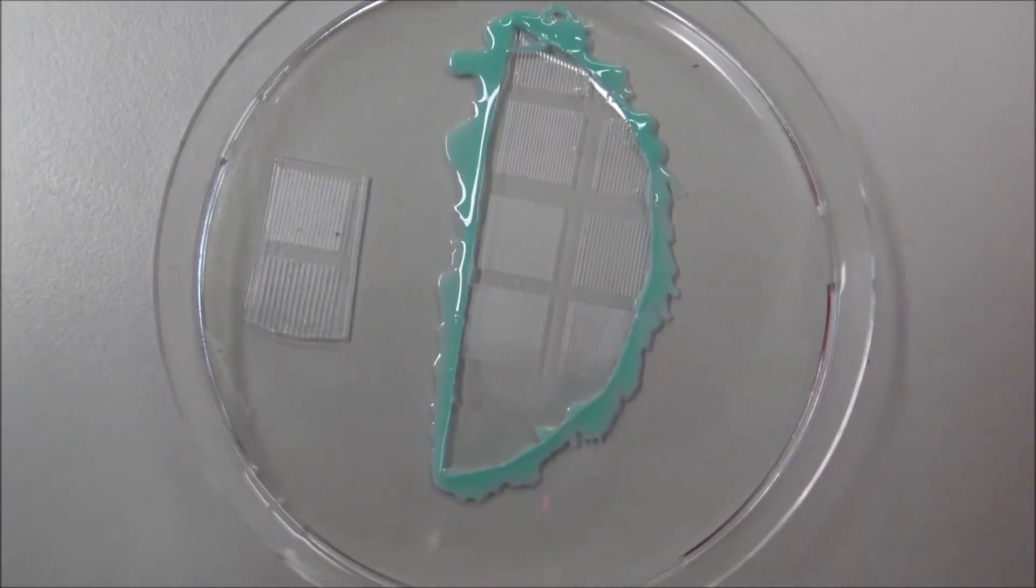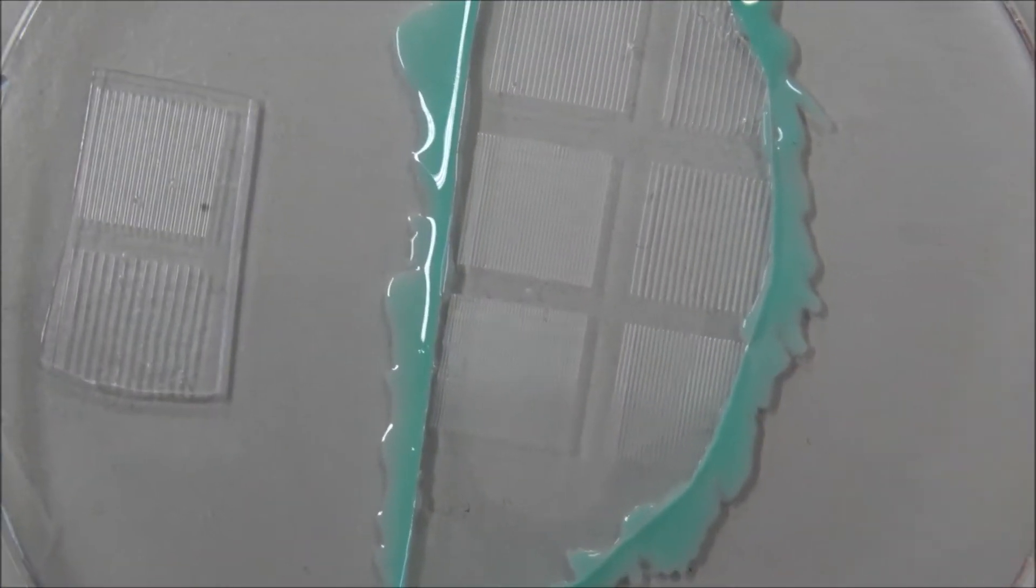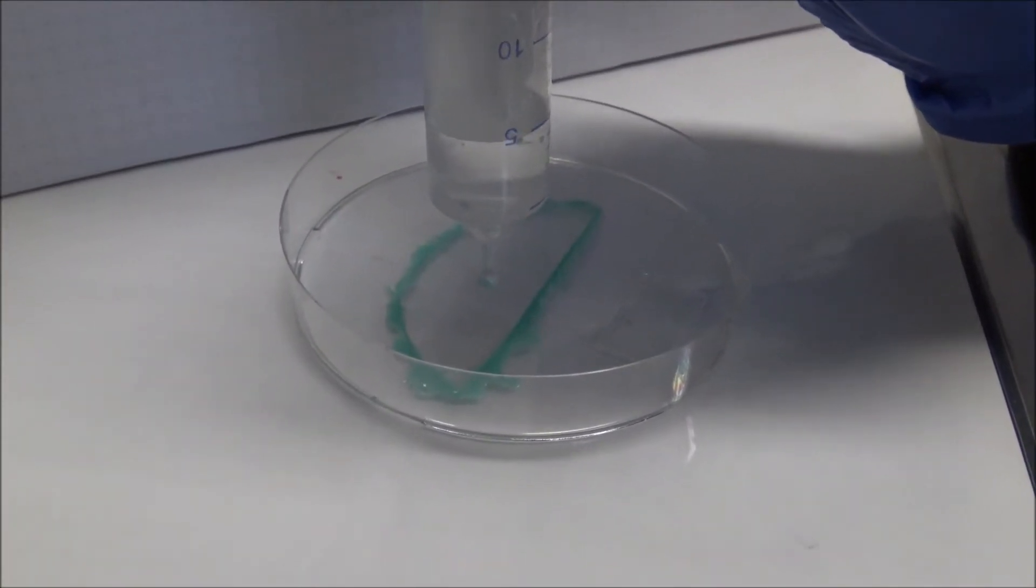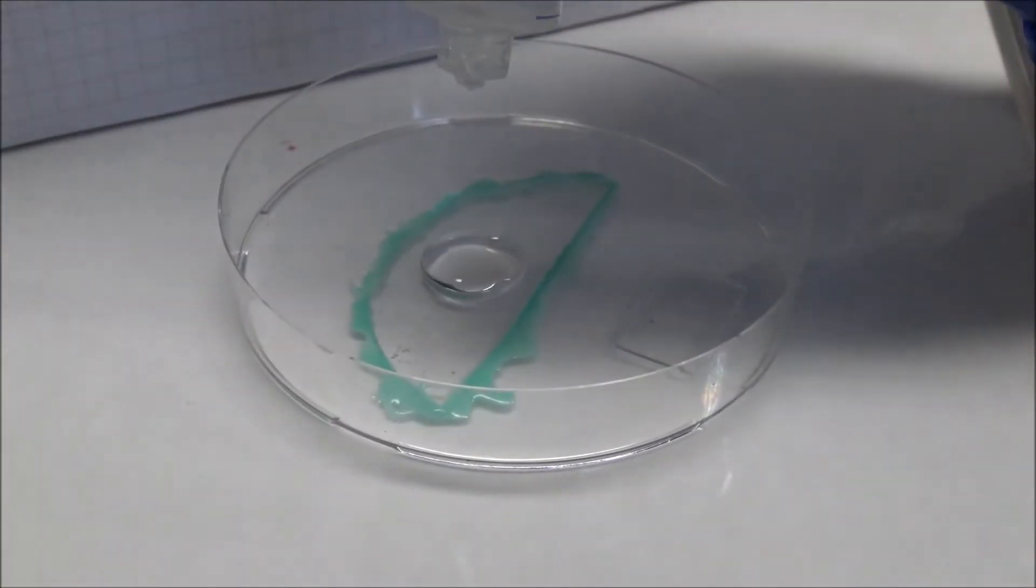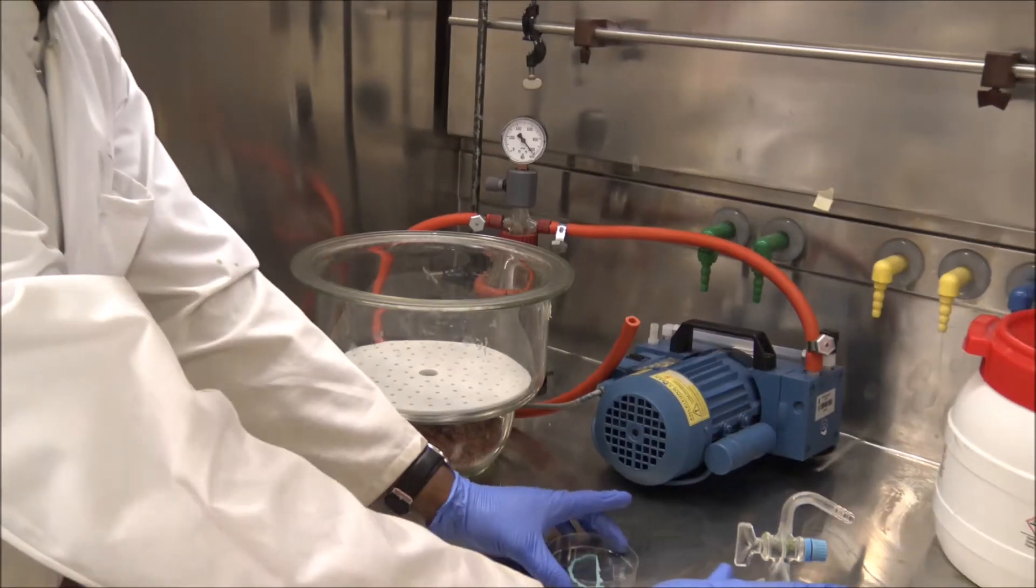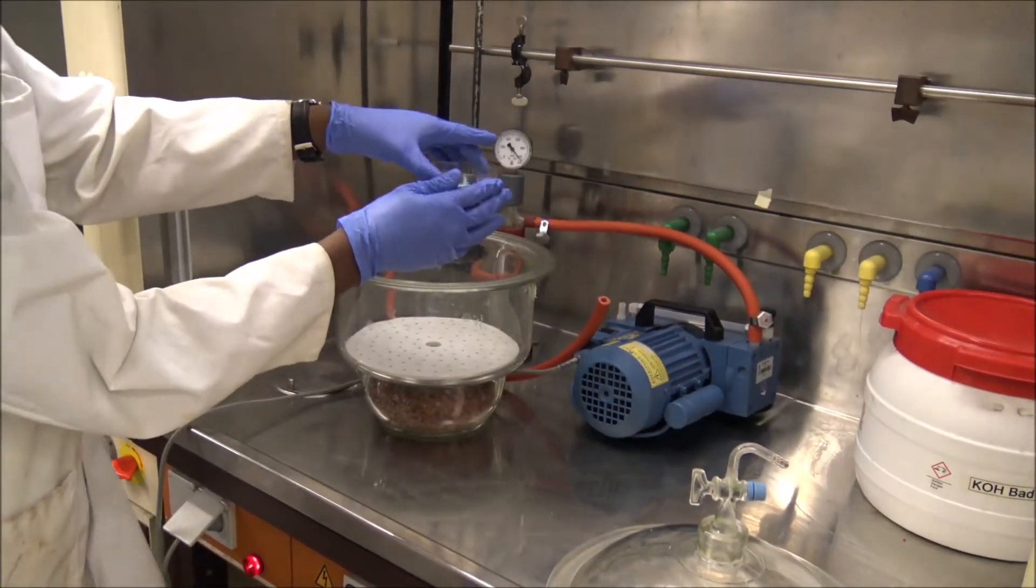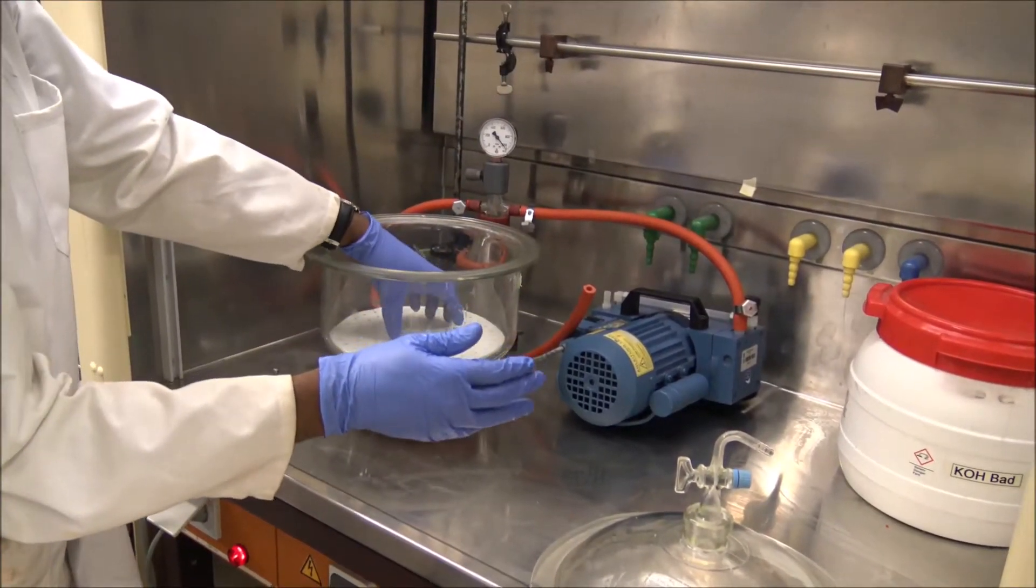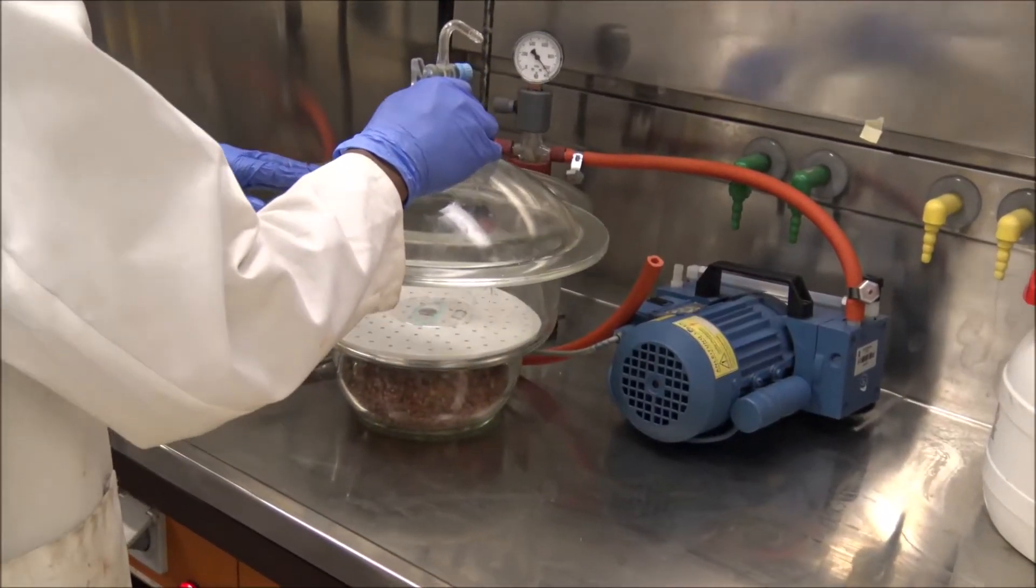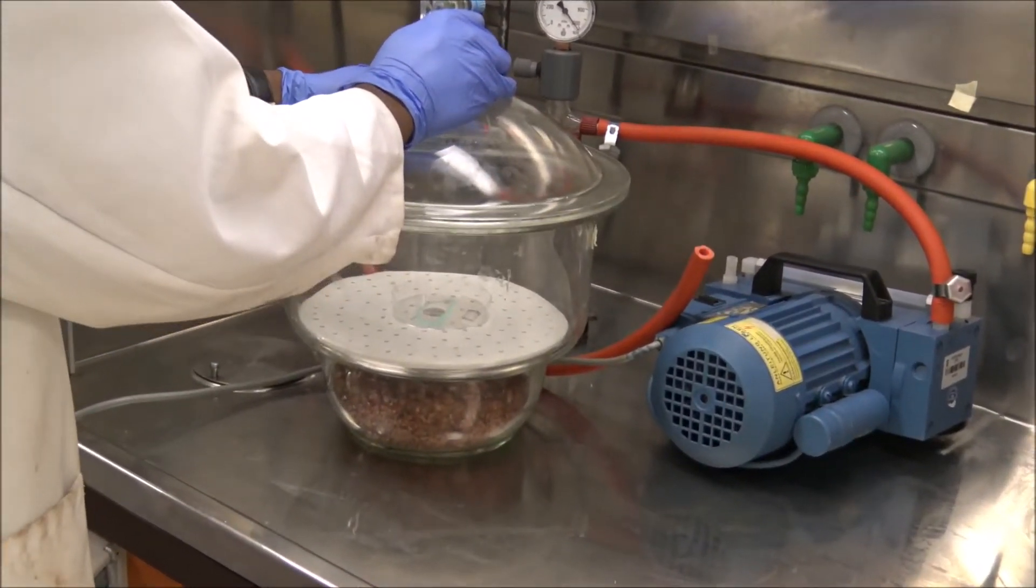We used concave molds to get PDMS surfaces with curvature radii of 48, 63, and 166 micrometers. Then we vacuumized to avoid air bubbles in the polymer mixture before the polymerization took place at 85 degrees Celsius in the preheated oven for one hour.